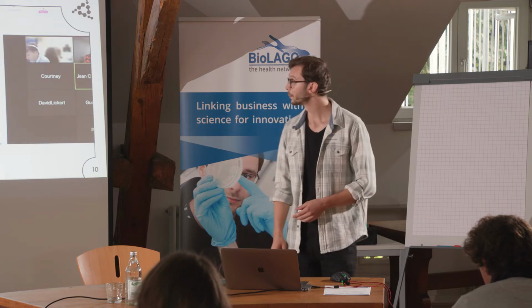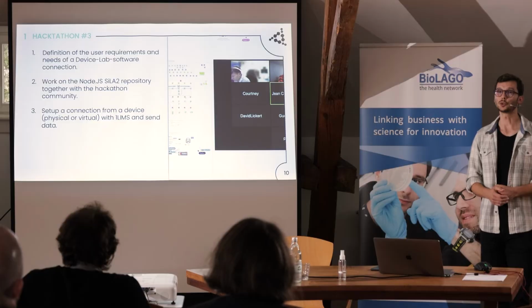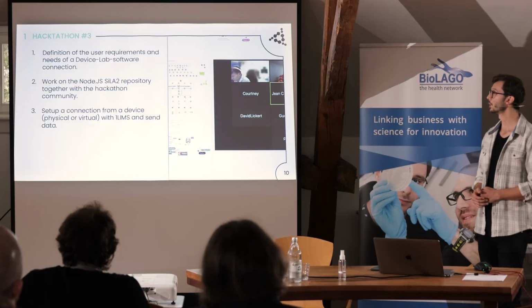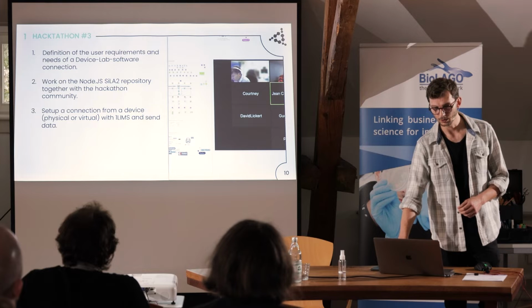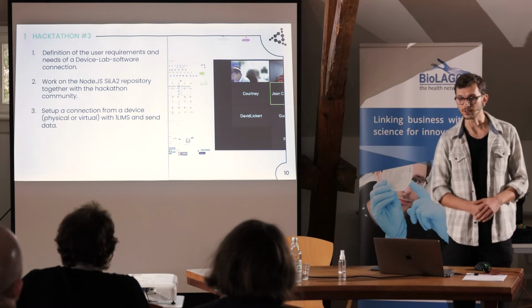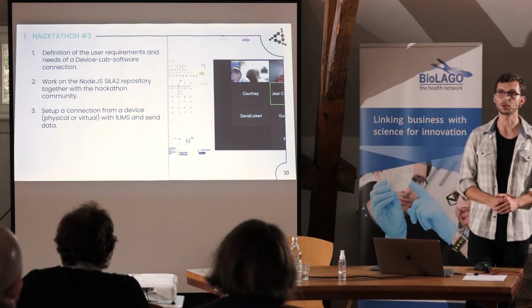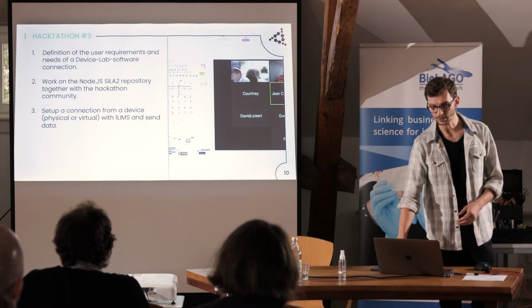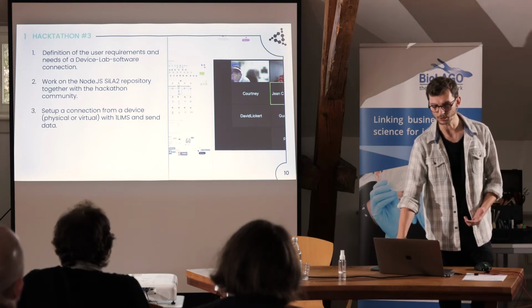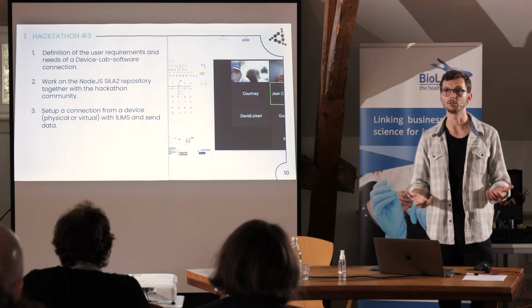At the next hackathon, we defined the user requirements of the integration for device-lab connectivity. The second point, and the work we did, was to work on the Node.js repository for SiLA 2, to improve it and make it fully working, to get the handshake between a LIMS system and a virtual device at the third hackathon.